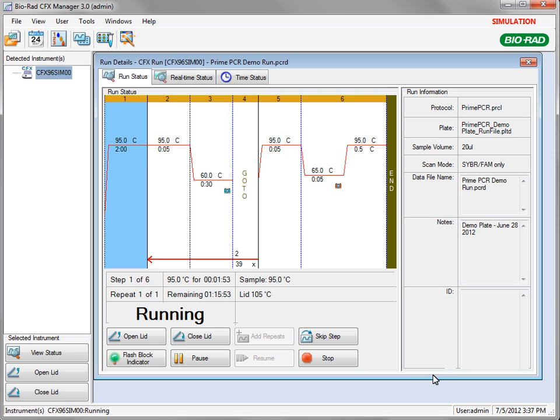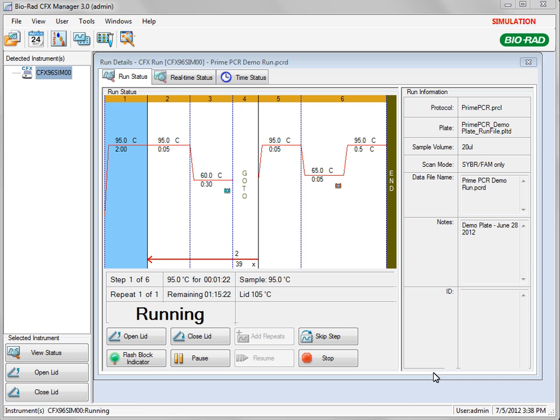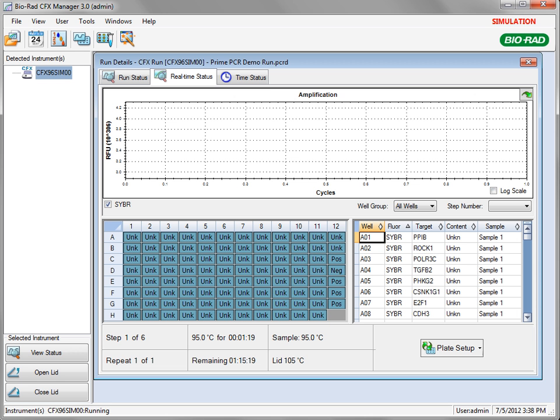Once the run has started, the Run Details window will be displayed. The Run Status tab shows the current step for the protocol being run. The process of amplification can be monitored from the Real-Time Status tab.